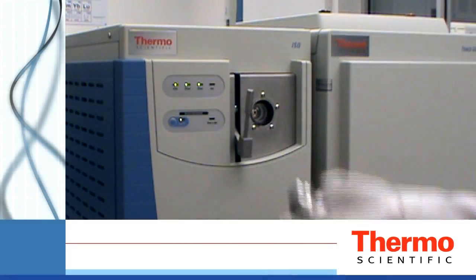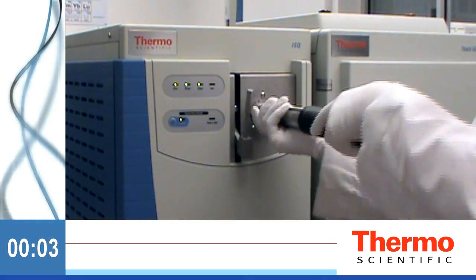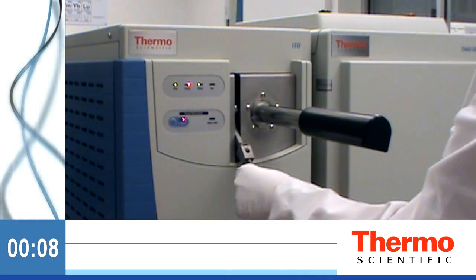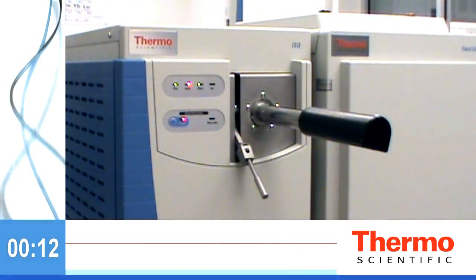Remove the vacuum interlock knob. To exchange the ExtractaBrite source, simply attach the source exchange tool and evacuate the small amount of air between the tool and the valve. All source exchange operations take place under vacuum while maintaining temperature set points. You never have to worry about venting your system.